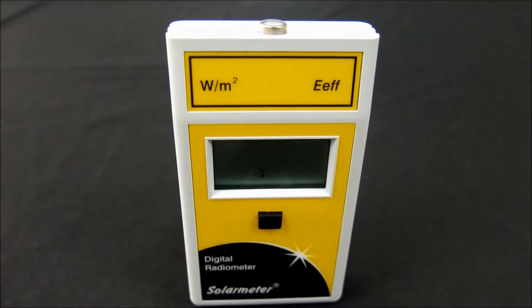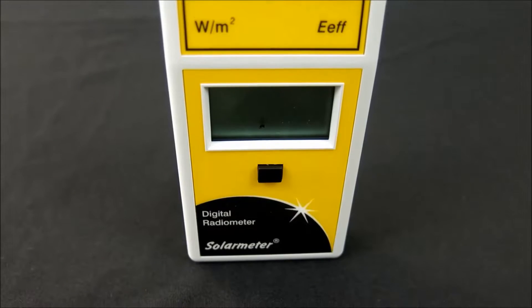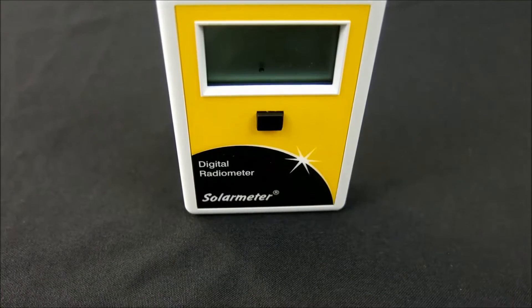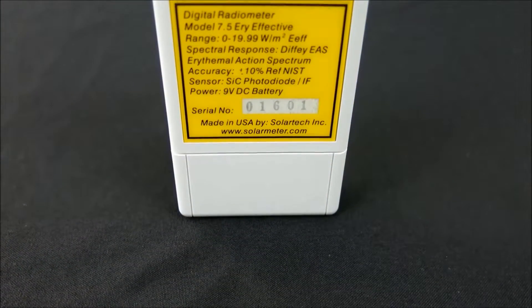It can also be used for acrylic shield transmission and eyewear UV block comparisons. Let's take a closer look at this product in greater detail. The NIST traceable model 7.5 features an irradiation range of 0 through 19.99 effective watts per meter squared and response of 280 to 400 nanometers weighted to the skin's erythema action spectrum.